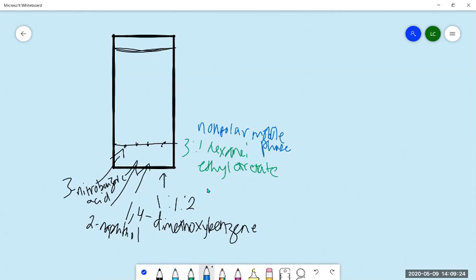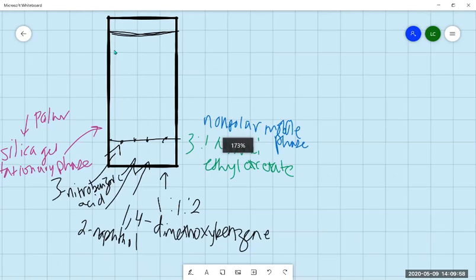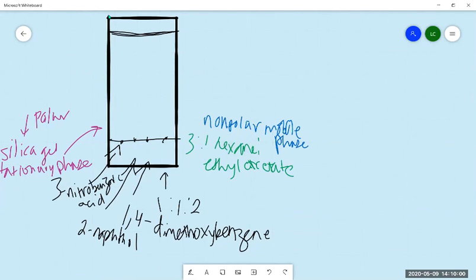And then your stationary phase on the TLC is on the sheet. It's not the shiny side, it's the other side where it has the powder that cracks. That powder that cracks is your silica gel, and it's your adsorbent, which is your stationary phase. What you need to know about silica gel is that it's polar. So you have a polar stationary phase and a non-polar mobile phase.